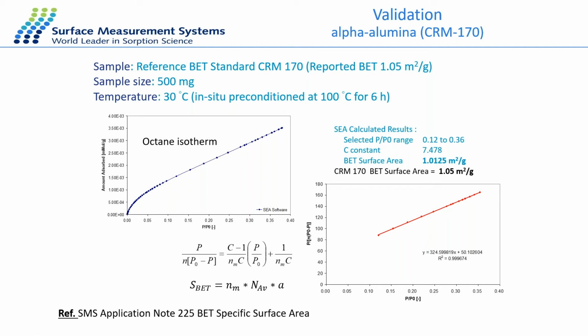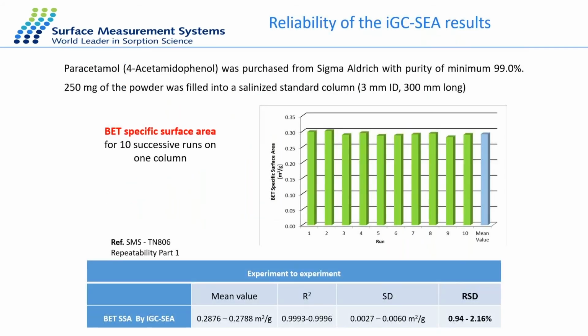The validation of the instrument included other reference materials as well, which you can find in application note 225 if you are interested in the validation of the technique.